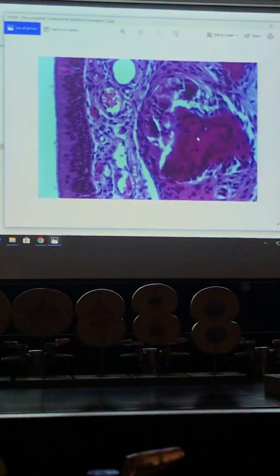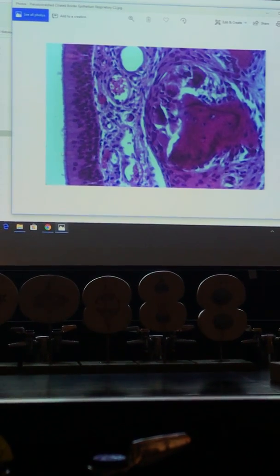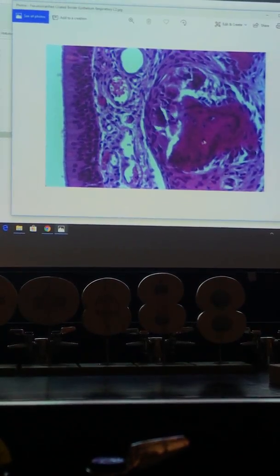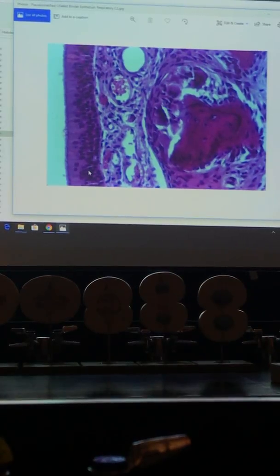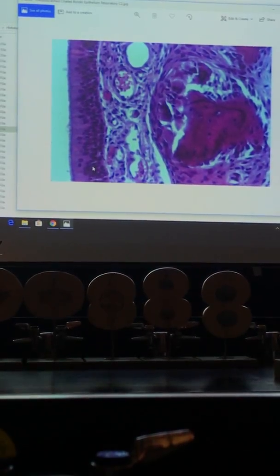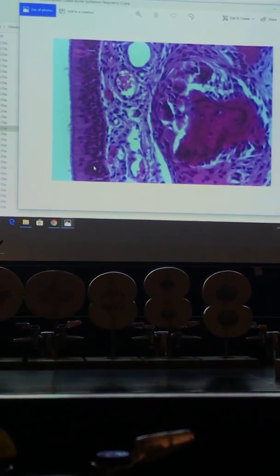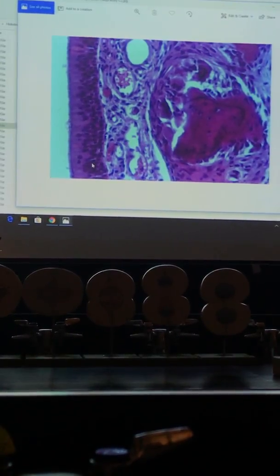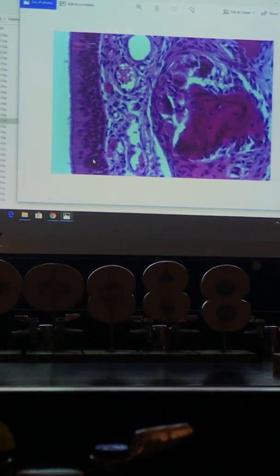When you look at your slide 34, or some of your slides 4, you'll see all kinds of tissue here. This is the lumen. Here's some areolar connective tissue and some cartilage we'll talk about tomorrow, but this is what I'd like you to look at today. How many have done histology before of any kind? If you see pink slides, that's acid stained. Blue slides are basic stained. I'll never ask you that, but the point is, you need to know structure, not color. So all your slides are stained the same. Some of these are stained opposite. So don't memorize colors. Does it make sense?